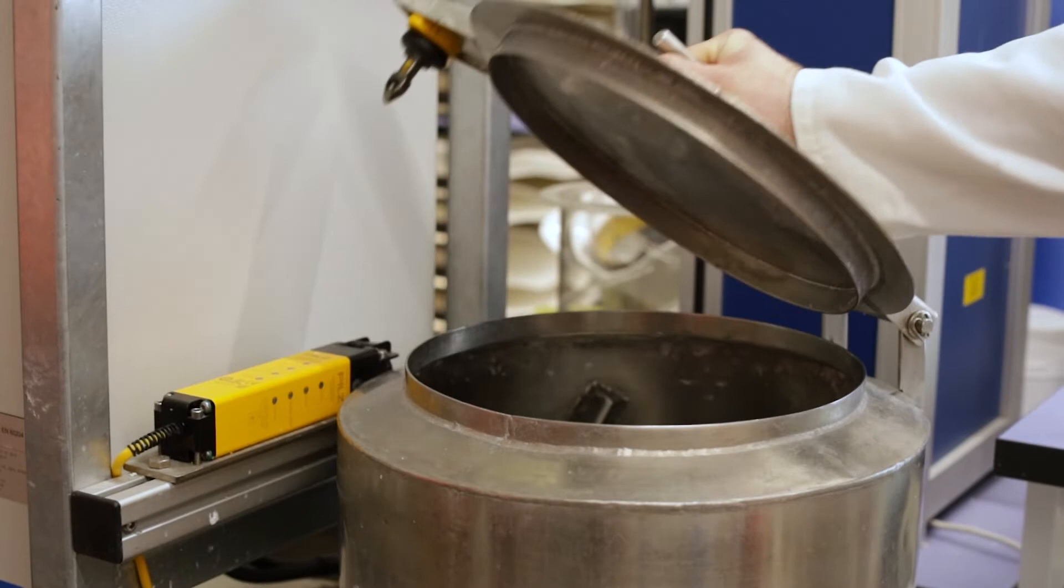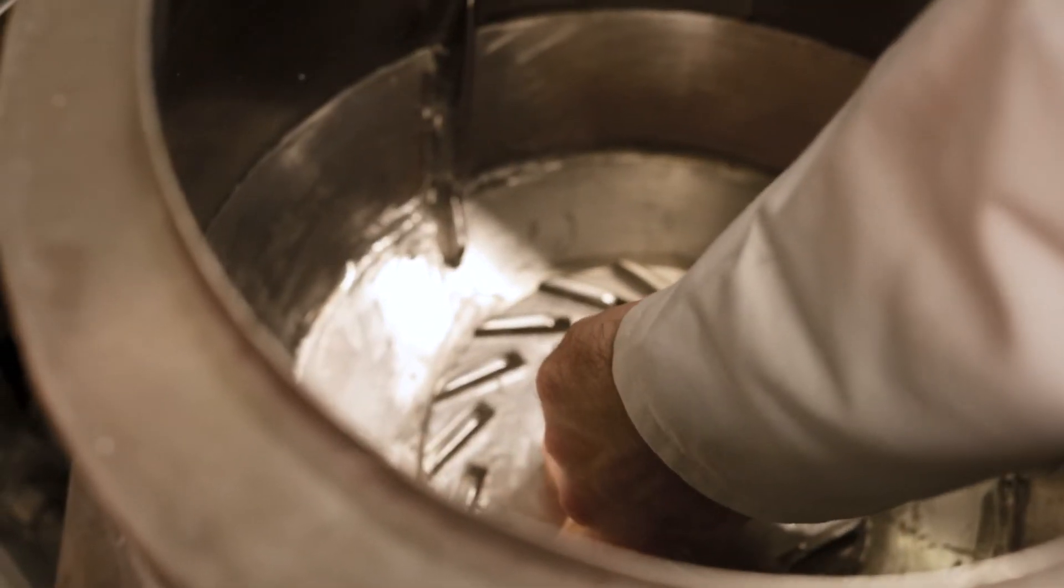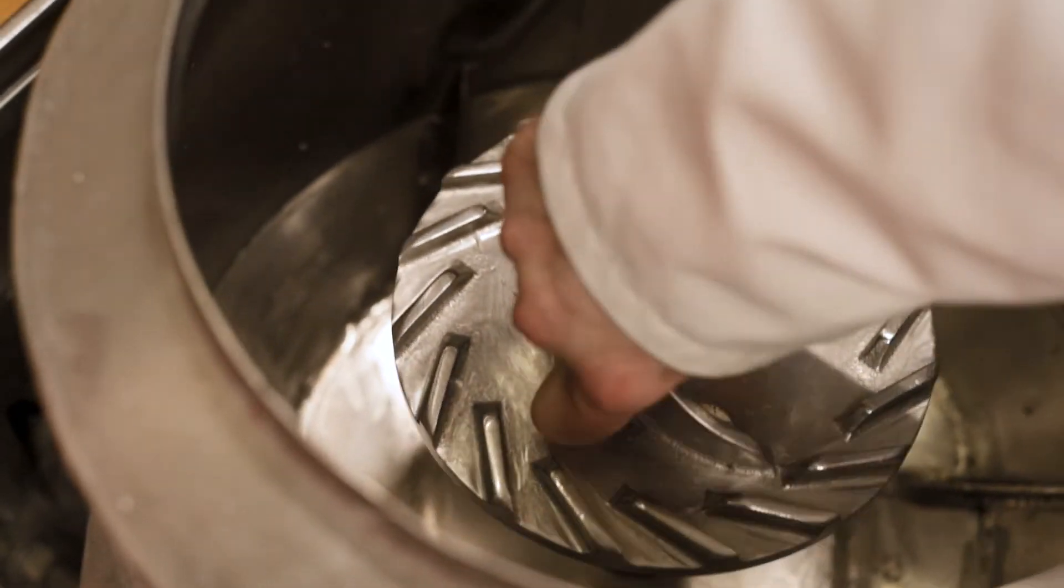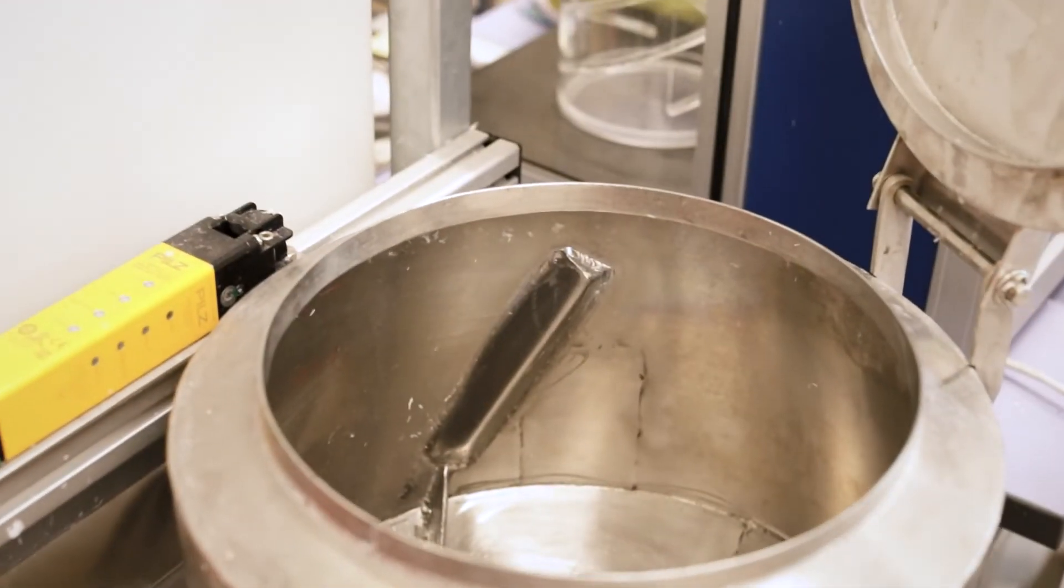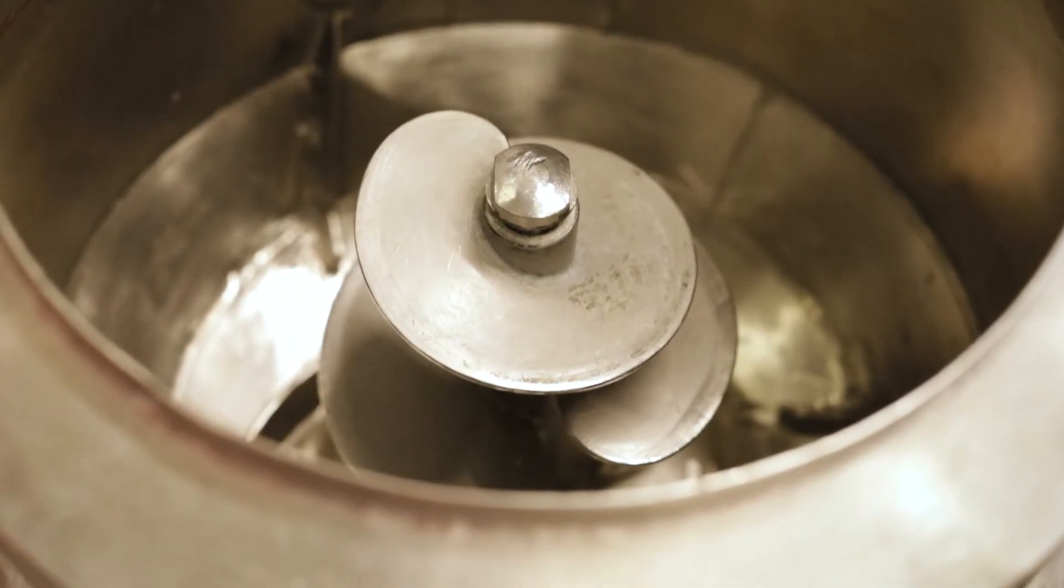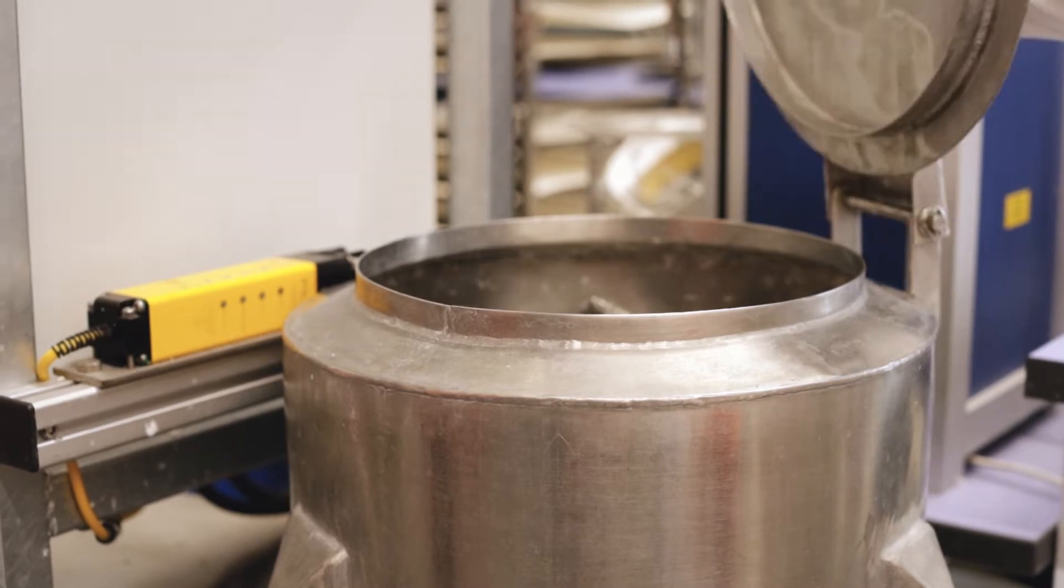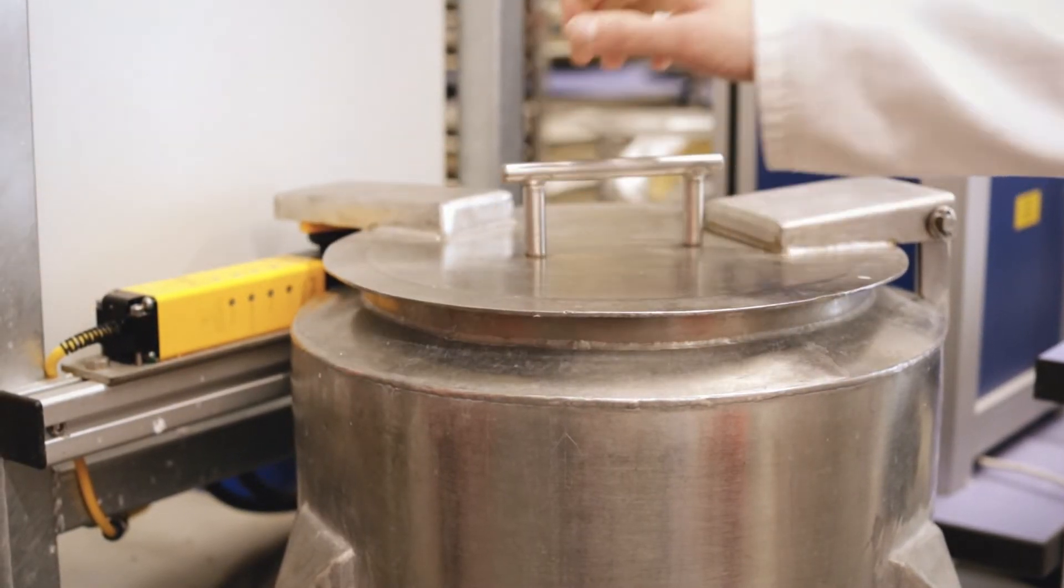For certain tests, only slushing of the pulp is required. For small quantities, below 70 grams, the standard disintegrator is sufficient. For larger quantities, up to 2 kilograms, we use a pulper that can be operated in both the low and medium consistency range, up to 12%.